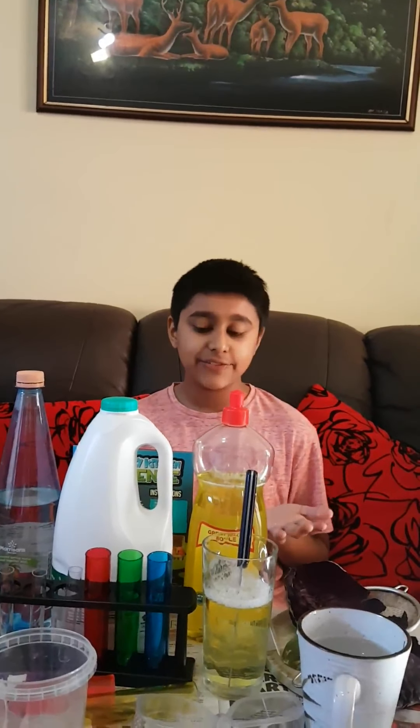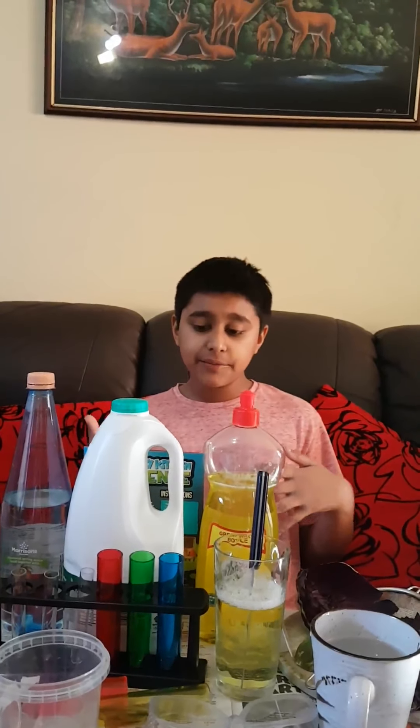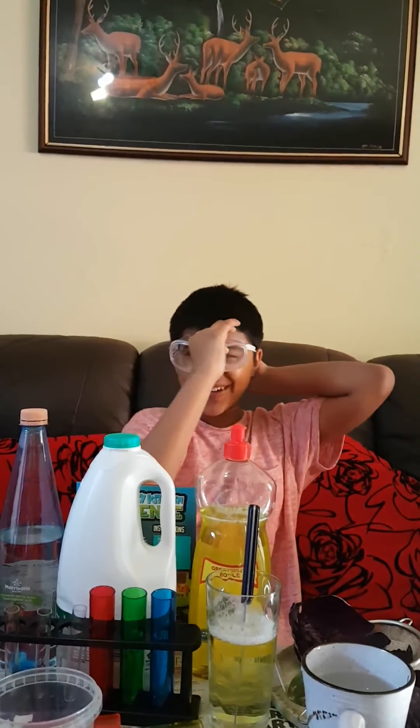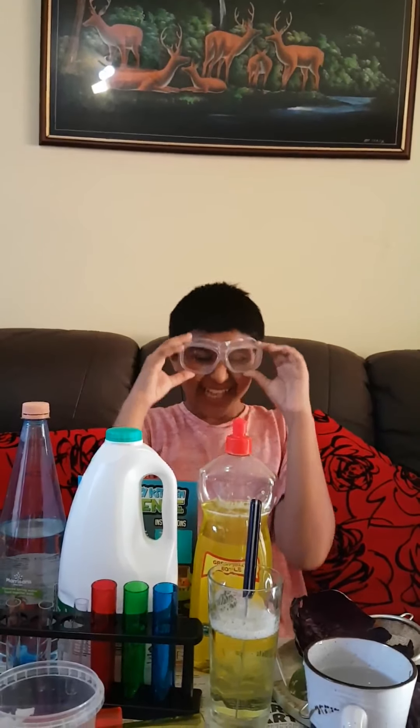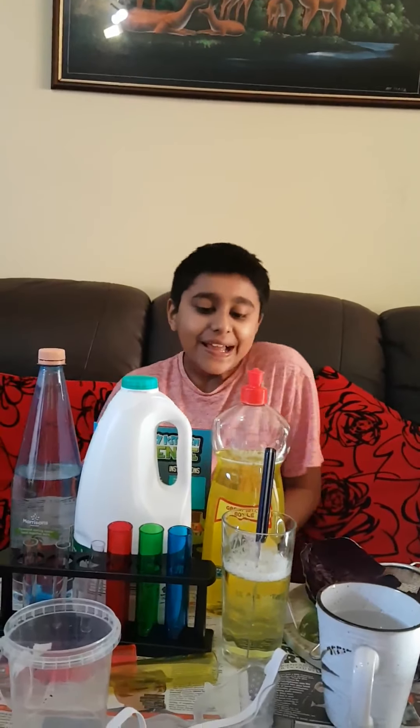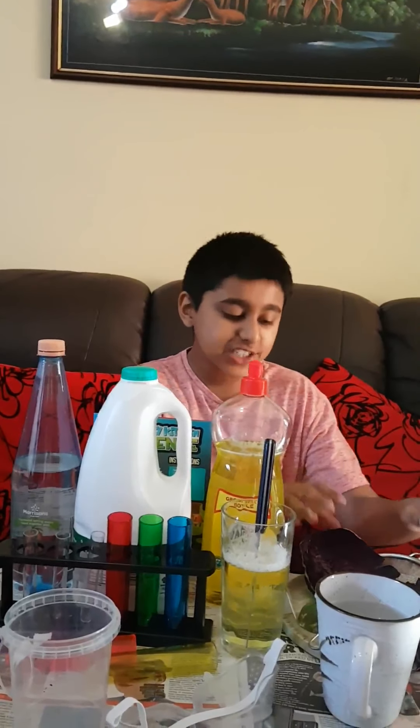You will also need a record sheet if you have one. And I would recommend having some safety goggles, just in case, because you're going to be dealing with highly acidic and alkaline and neutral things, so you might as well have them for safety.